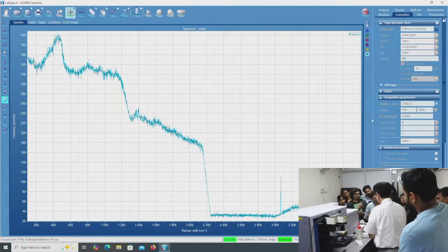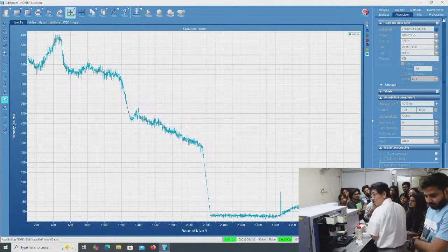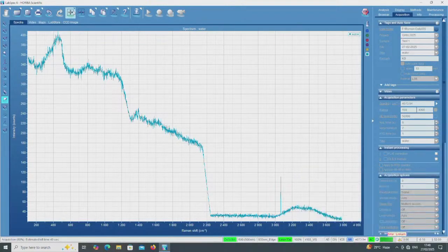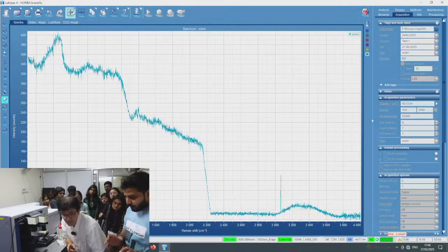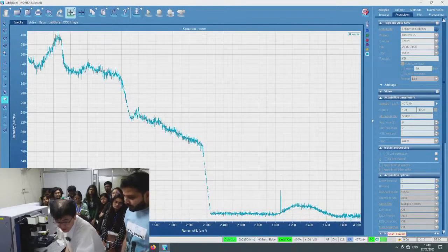We are looking for a good point in the 3D volume. Already water is here. Should we set the region between 2800 and 4000 to check the focal point? This region.